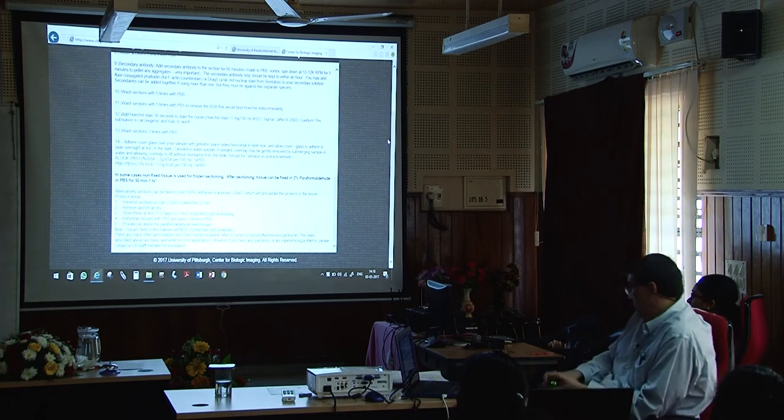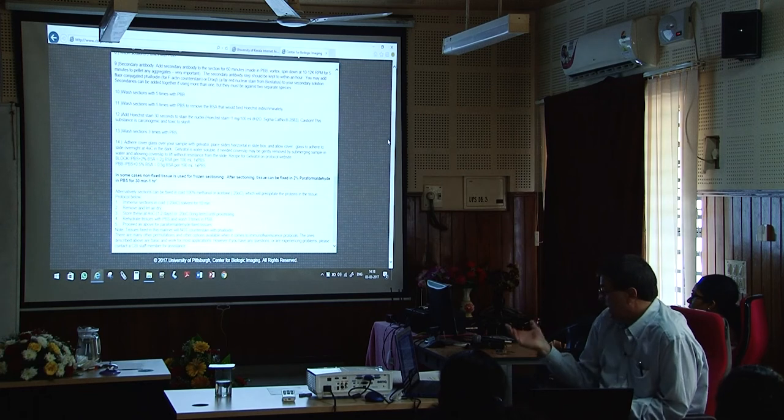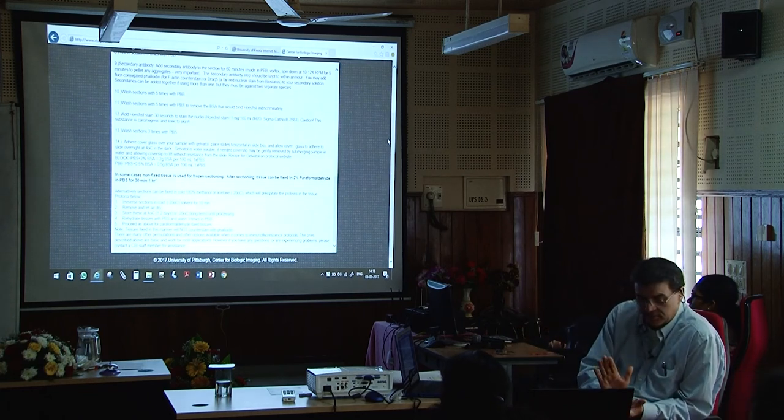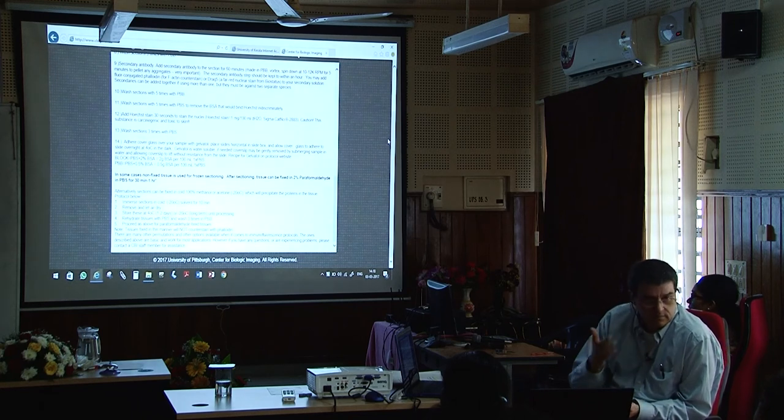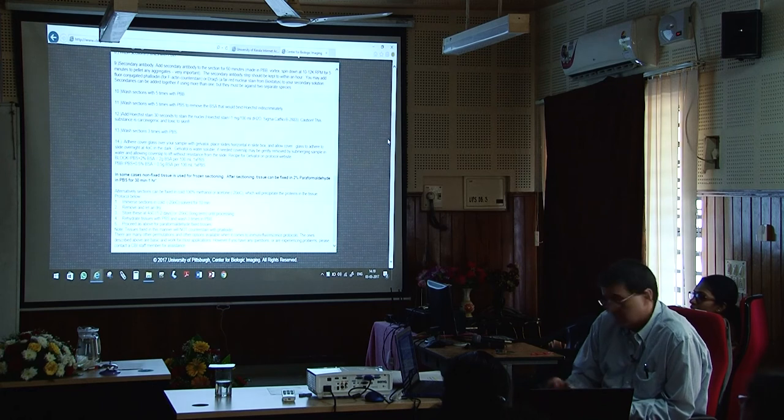Let's see what else they got here. That's pretty much about it. And then again, tissues you'd have on a slide. So this would be where you'd mount, use your mounting media, and try not to make bubbles. Any other questions about any of this?